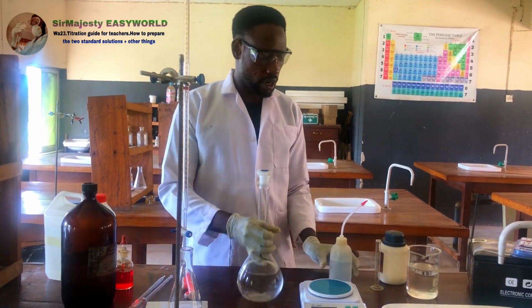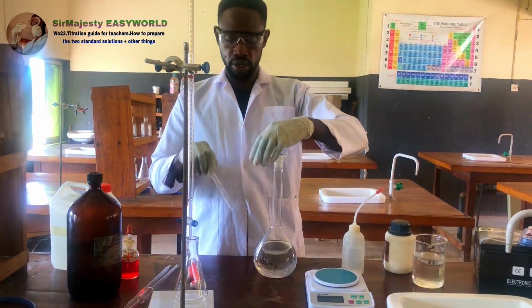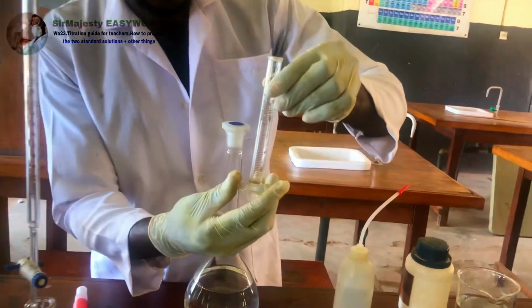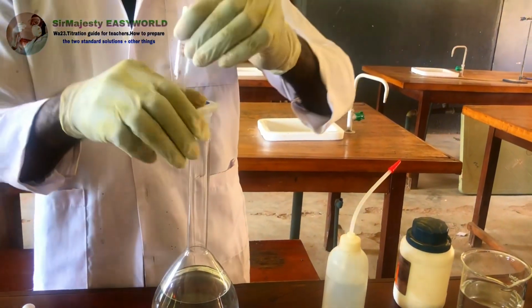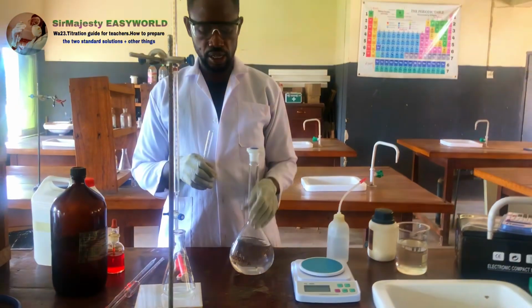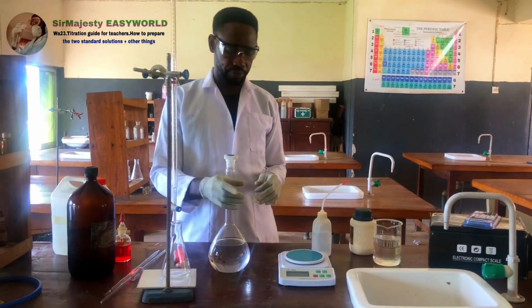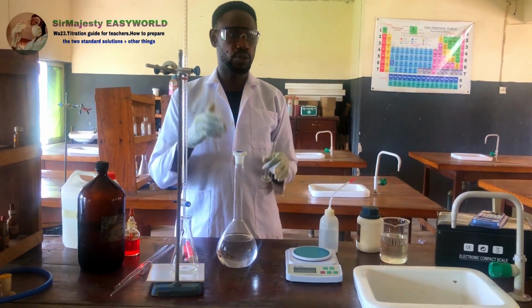To know the specific gravity of my HCl, I need this measuring cylinder. This is a 10 mil measuring cylinder. Then I need the weighing balance, which is here. Then the acid itself. Remember that density is actually mass over volume.